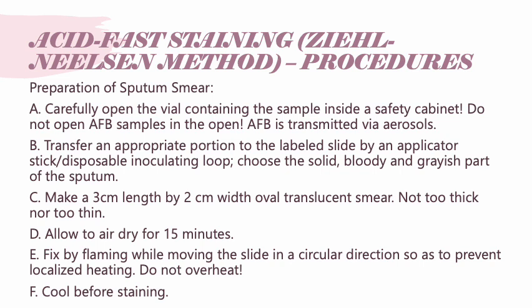Now, fix by flaming while moving the slide in a circular direction so as to prevent localized heating. Do not overheat, as it will disrupt the natural components of the cell wall, thereby decreasing the efficacy of the staining procedure. Then cool the slide before staining.